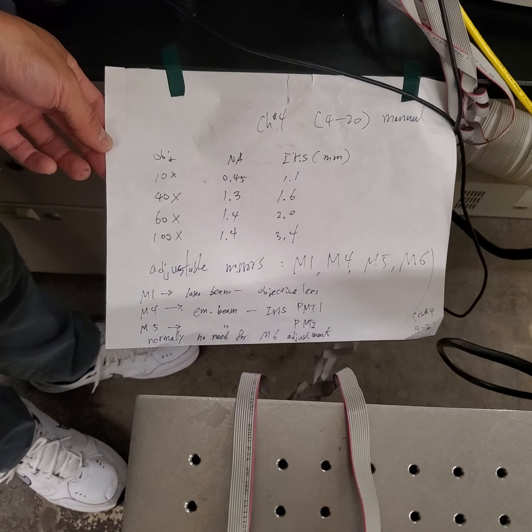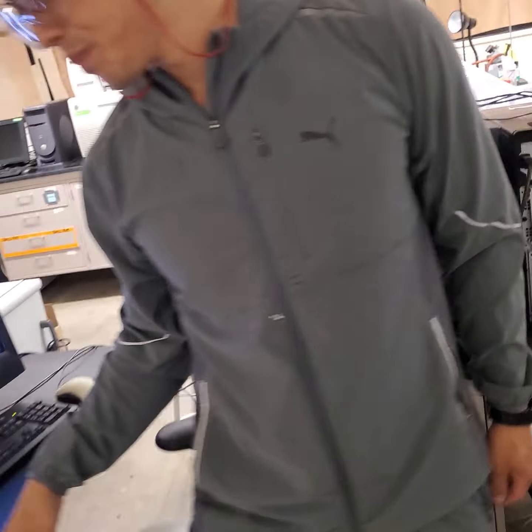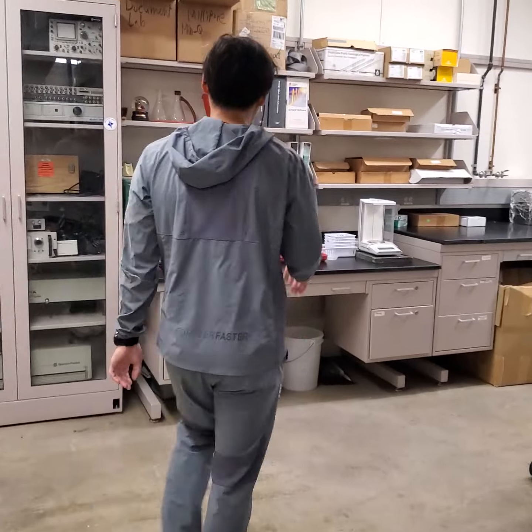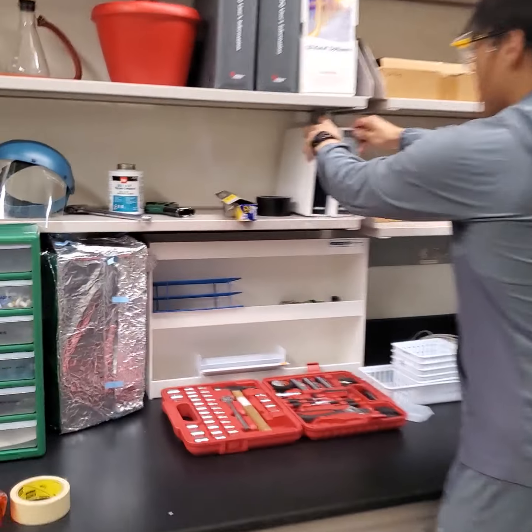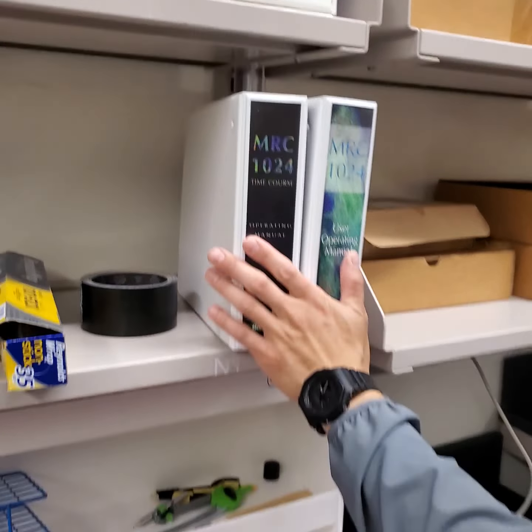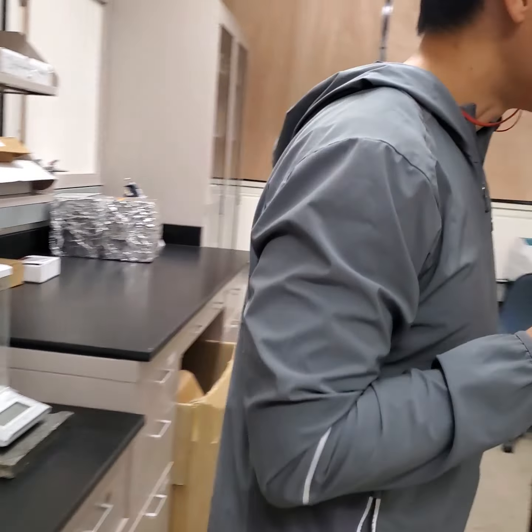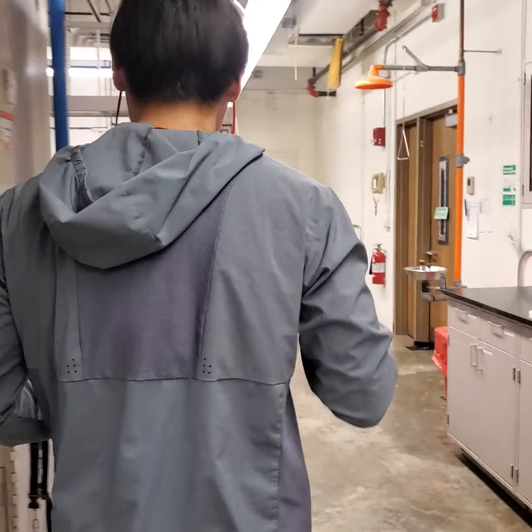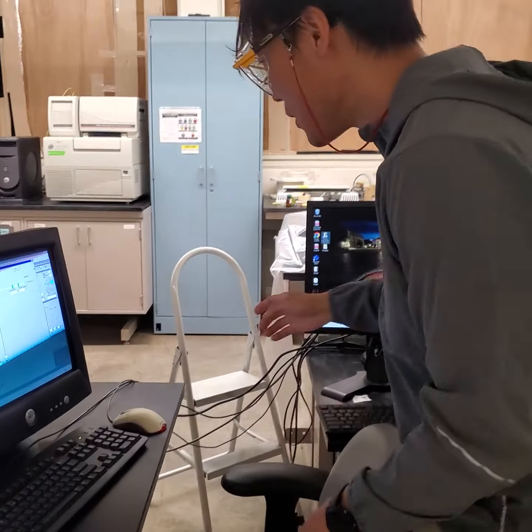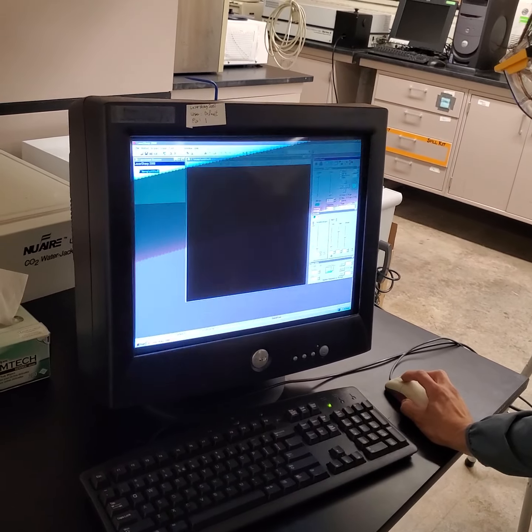This is also well noted in the manual. All the procedures are in this manual, MRC 1024, right? So all the procedures are here. So please study by yourself. It's not possible to teach you everything through this video. So I think that's the minimal things I can explain.